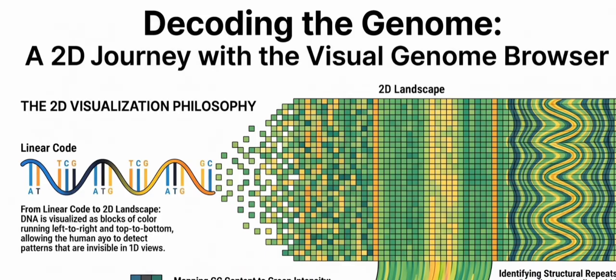But wait, humans are diploid organisms. We have two copies of every single chromosome, one inherited from our mother and one inherited from our father. So a patient doesn't just have one single variant for a gene, they have two distinct alleles. And navigating those dual alleles is where the software's contextual user interface design really shines. Recall the less than and greater than keyboard shortcuts we just discussed for jumping between exons. Right, the DVD chapter skip.